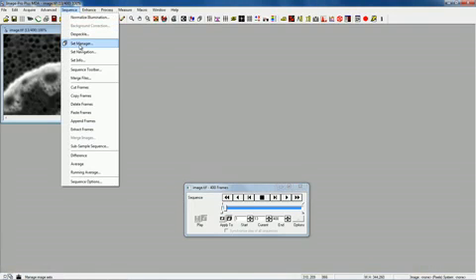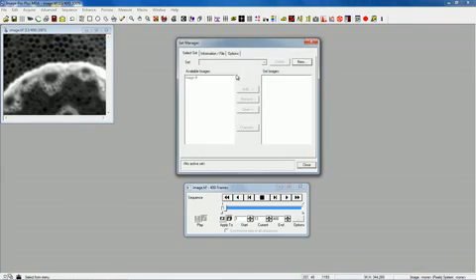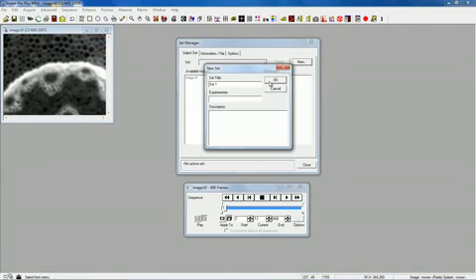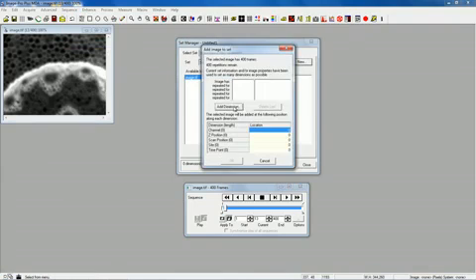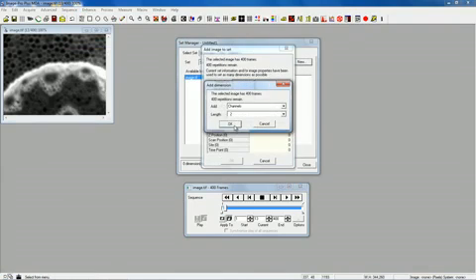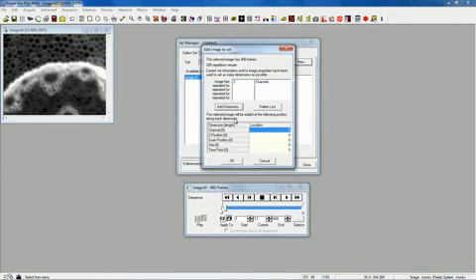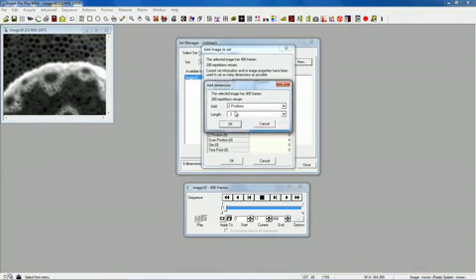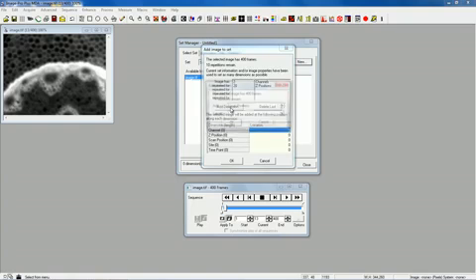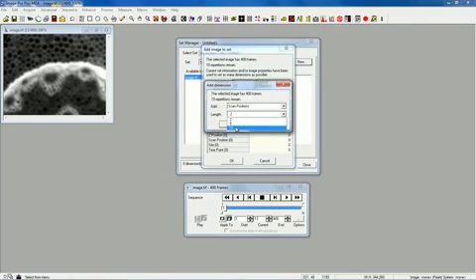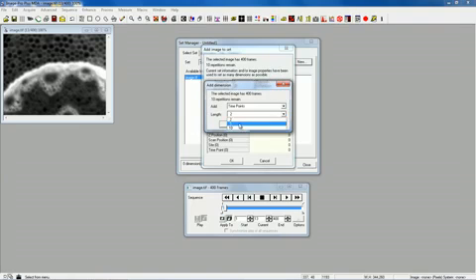So we just have to normalize this, so we'll go to Set Manager, New, OK, and we'll just add that. We'll say you have two channels, and we'll say you have 20 z-positions, and we'll say you got a scan, well, there are actually time points, 10 time points.